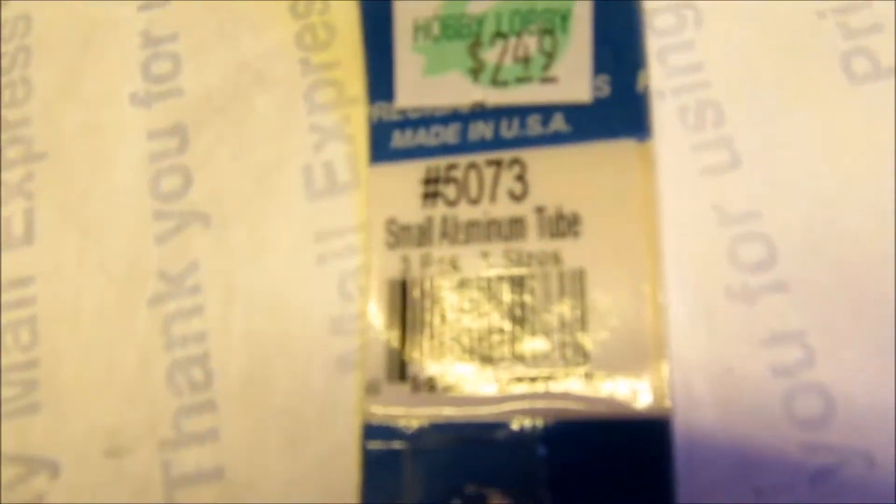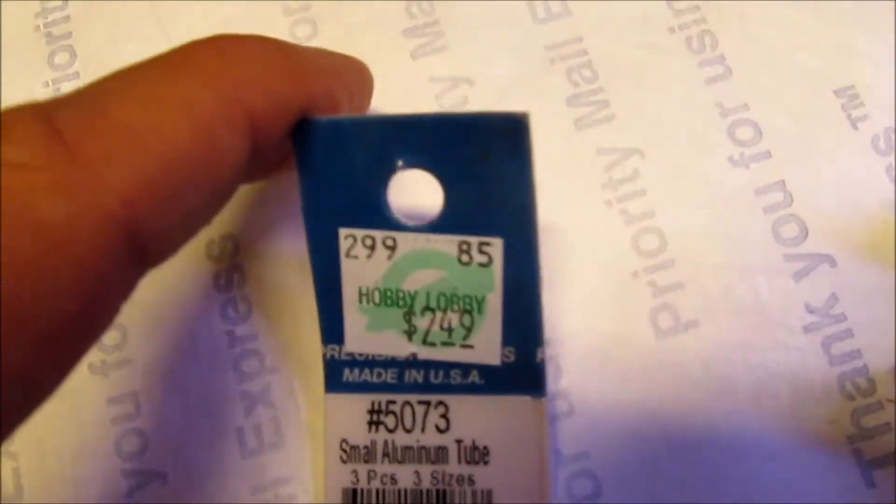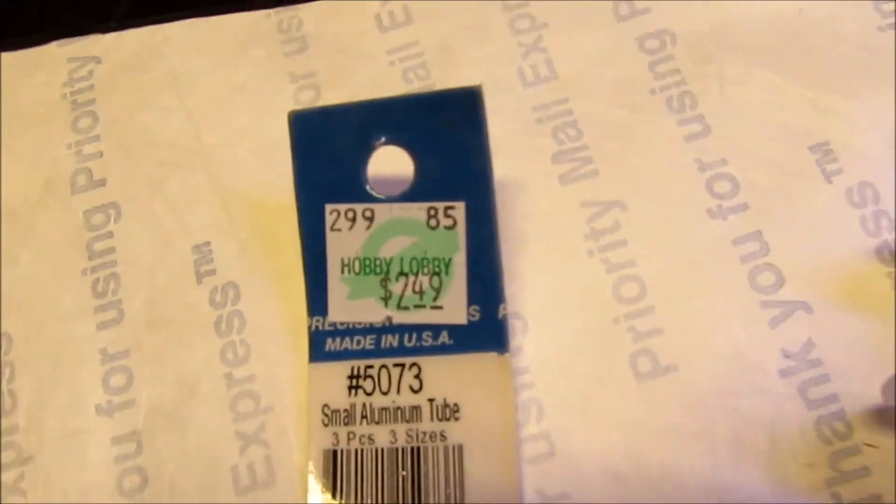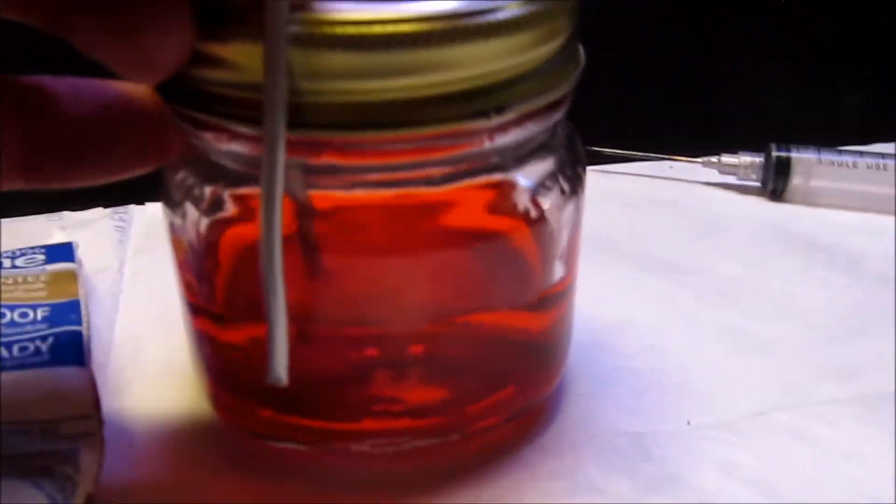Then we're going to need a little bit of soft aluminum tube—number 5073 from Hobby Lobby. They also have a 40% off coupon on their app every week. The soft tubing is what's actually going to go through the jar here and extend our reach all the way down to the bottom.